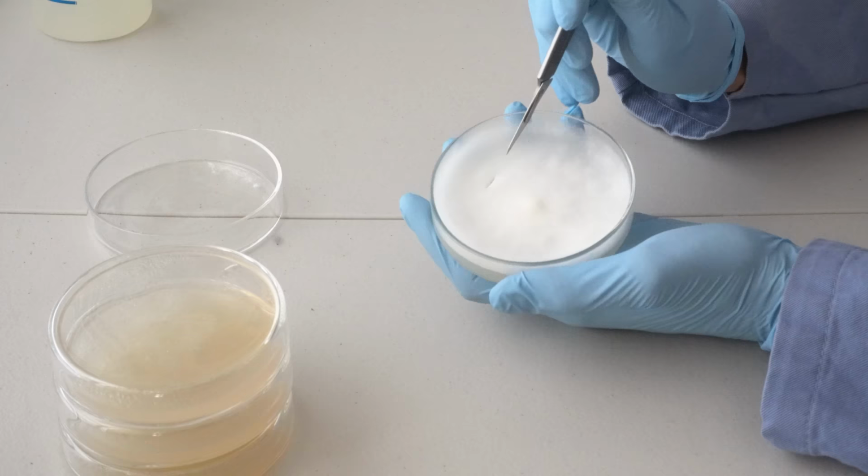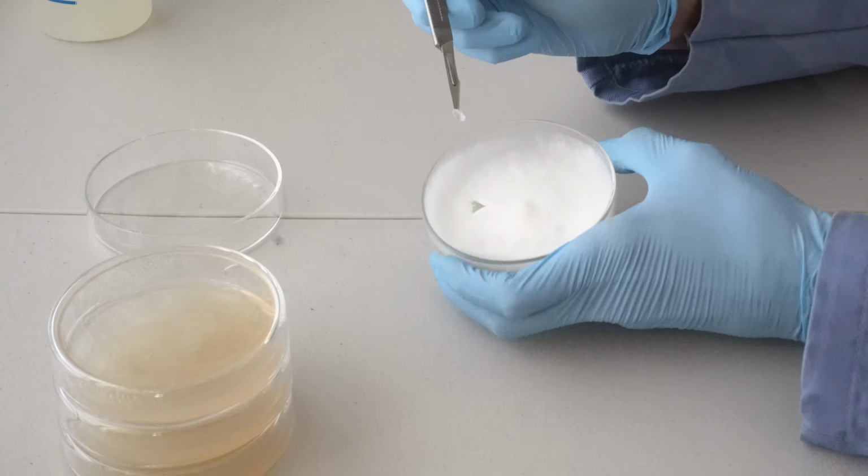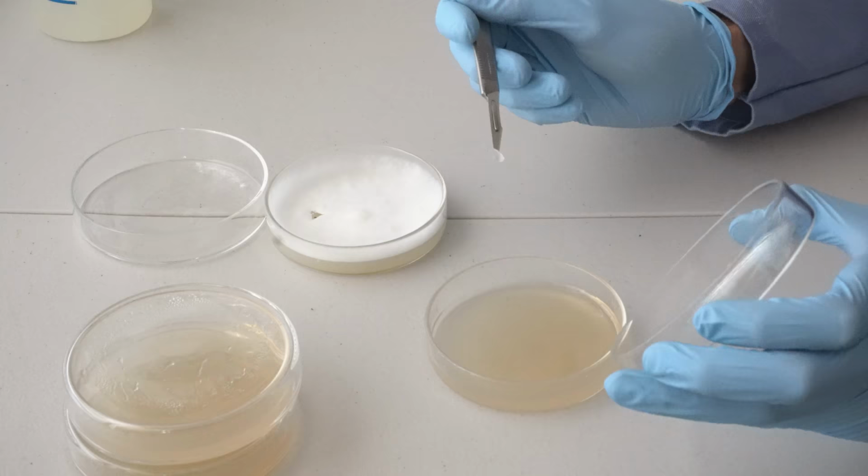After allowing the plates to grow for a week, we can select the ones that have had no visible contamination and grew a nice confluent fungal lawn. We can then transfer a small fungal excision to fresh agar and allow it to grow for another week to ensure we indeed have a pure, uncontaminated culture.